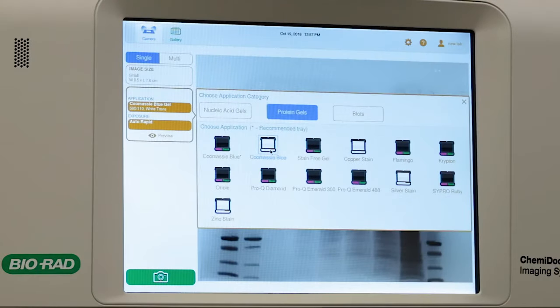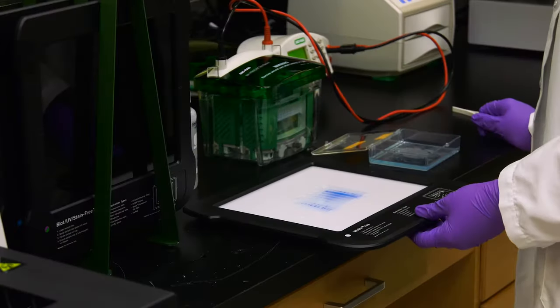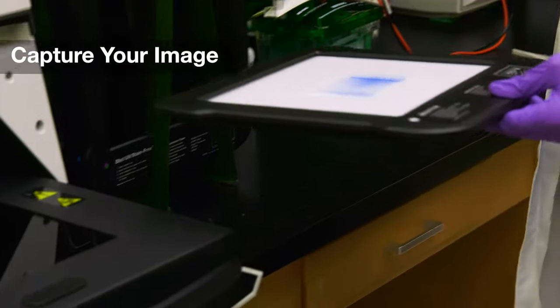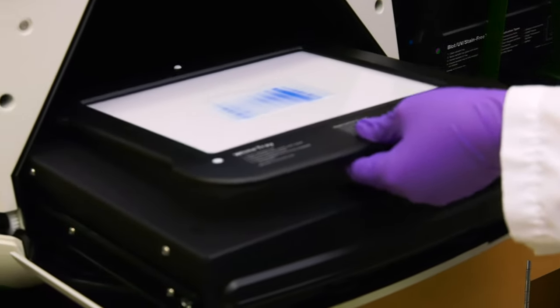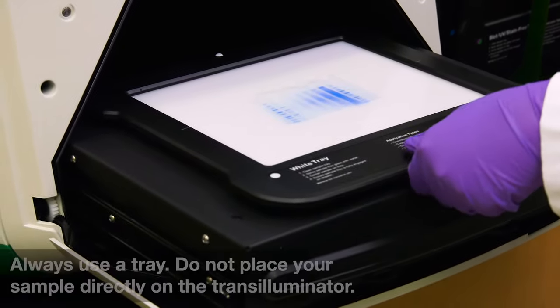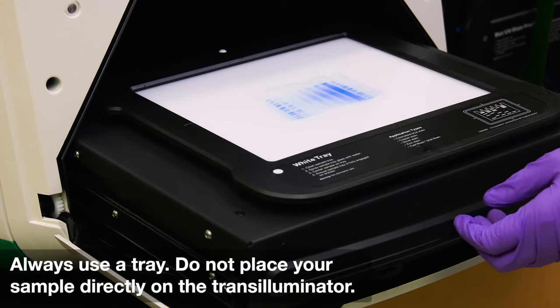SmartTray technology automatically recognizes application-specific trays and adjusts imaging parameters and software options accordingly. For colorimetric stains, select the white tray. Center your sample on the tray. When you are satisfied with the position, push the transilluminator back in and close the drawer.